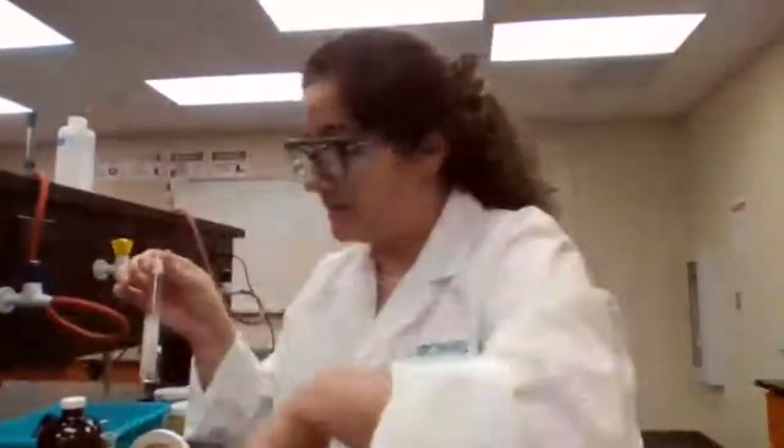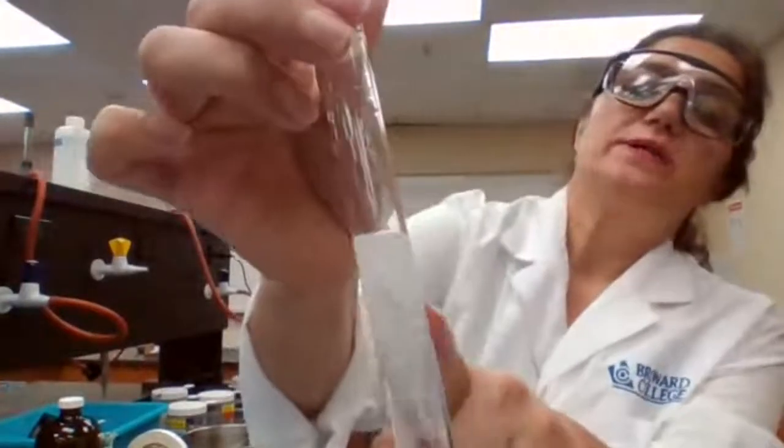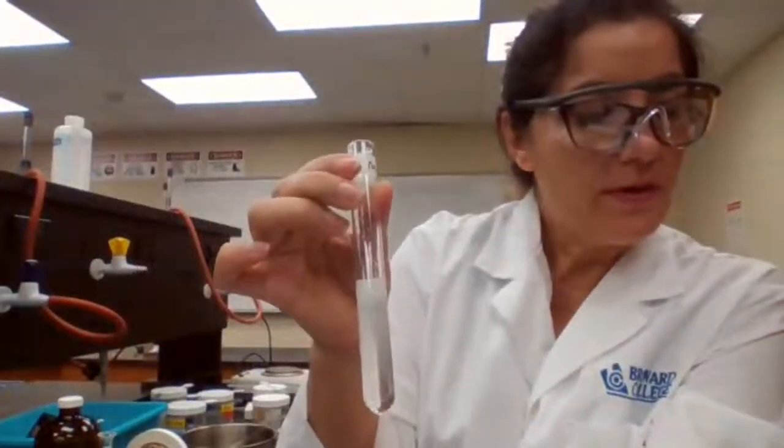Okay, to check, and it's going to take longer for 0.6. But my timer for 0.6 is right here. I still have the piece of magnesium in there. I just want to make sure you see it. See that still floating in there? That's for the 0.6. It's been 358 seconds already and is expected to take longer than the 0.8.